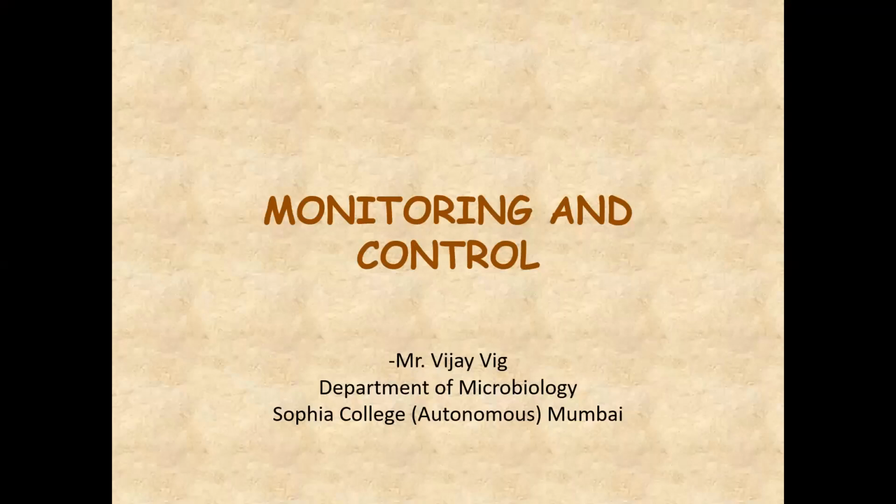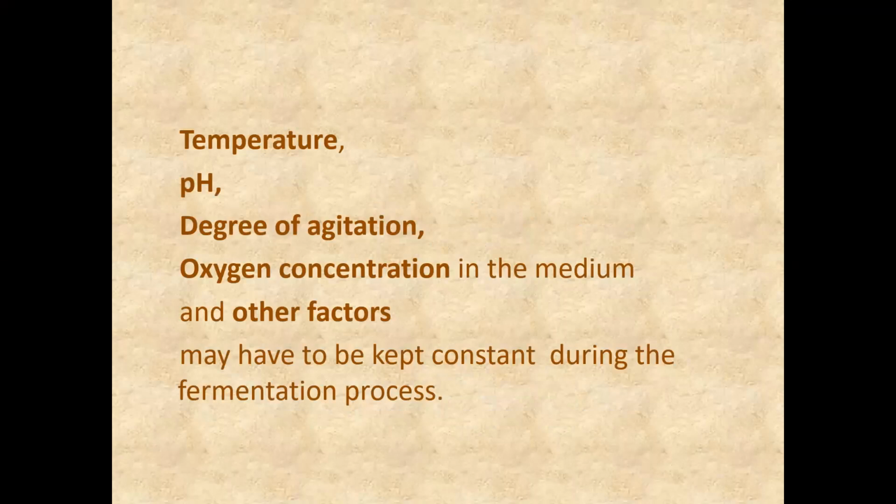Hi everyone. In this video, we will learn what is monitoring and control in a fermentation. Now, microbial fermentation is going on. You have selected a fermenter, you have prepared medium, you have sterilized the fermenter and medium both.